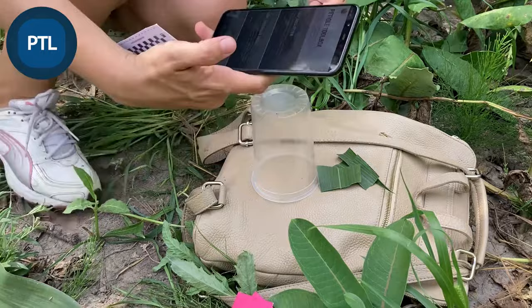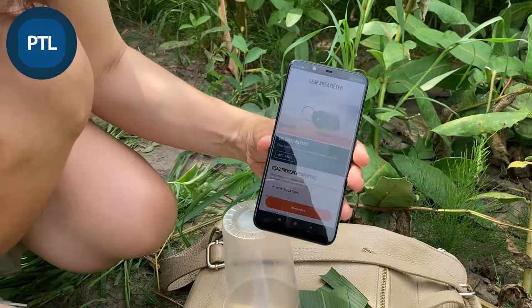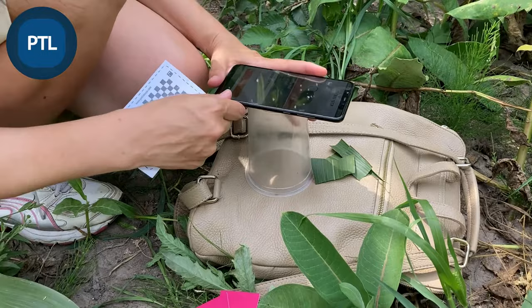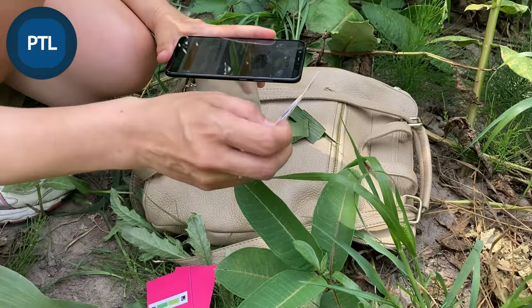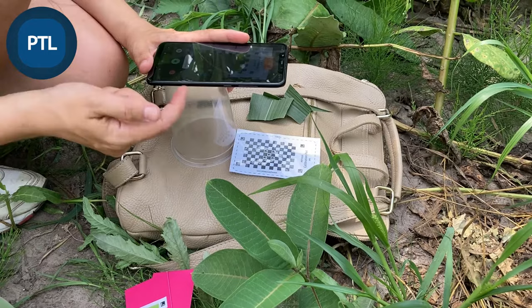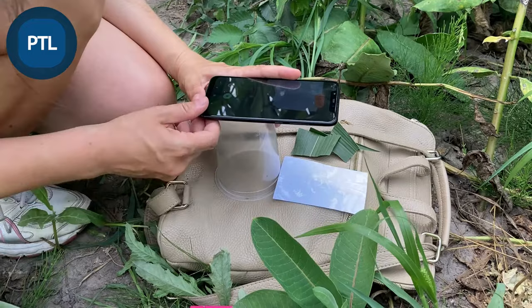Now I need to calibrate the camera, so I place the phone on the glass to have the same height for each measurement. I press the 'Measure' button, place the calibration pad, and the camera is calibrated. Then I turn it and here is the white area — ready for measuring.